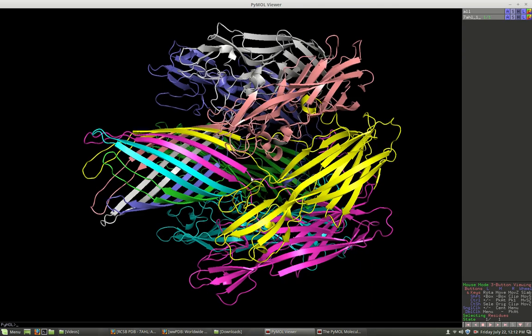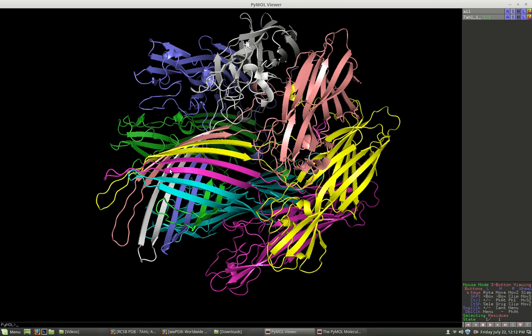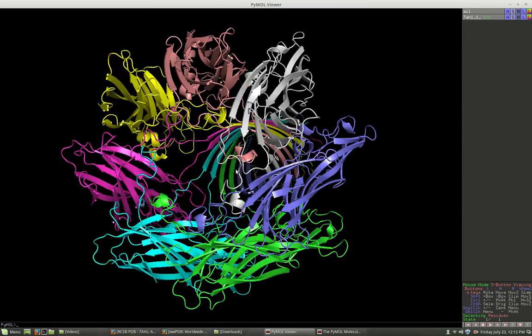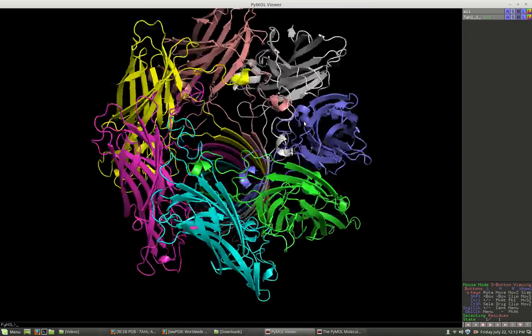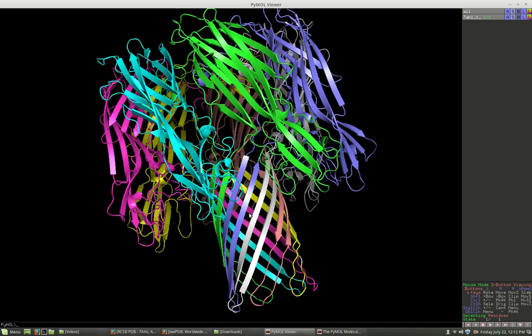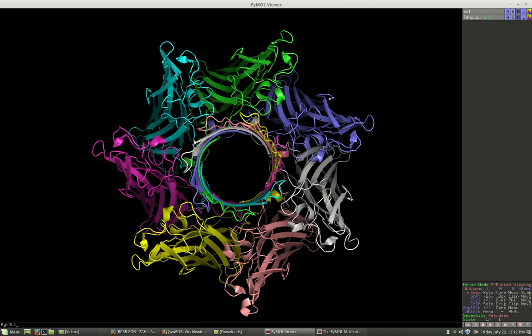Notice that there are some beta sheets that come around down here in this lower tube, and they connect to each one of the proteins up here in the top of the molecule. In this particular form, notice we do not see those atoms from the various proteins that touch in the middle. That's why this particular type of view is very pretty, but it doesn't give us some of the interesting chemical properties, the structures that we might want to see.